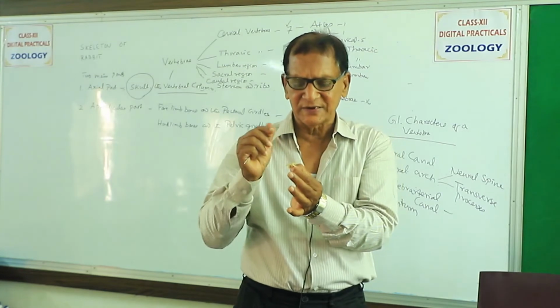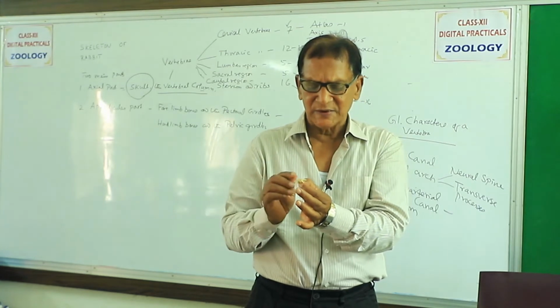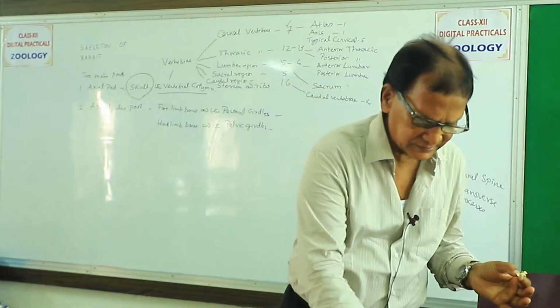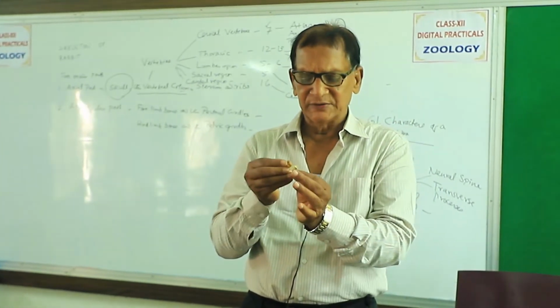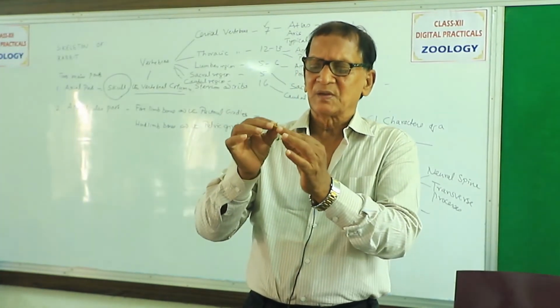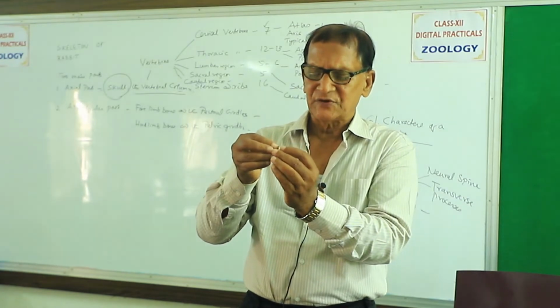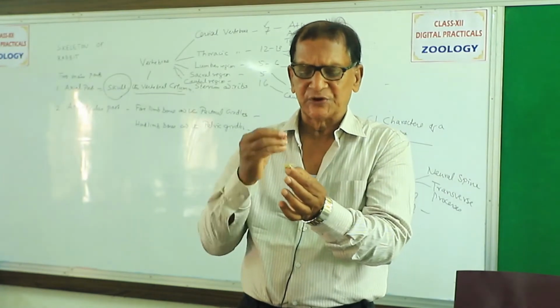The centrum or base is greatly reduced, and on either side of the centrum in the atlas vertebra we have two facets for the next vertebra, that is the axis, and the lower part. So this is the axis. The axis anteriorly possesses a pair of projections which find surfaces for attachment in the atlas posteriorly.